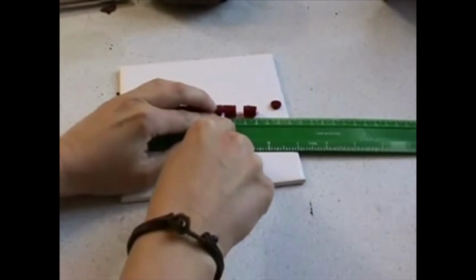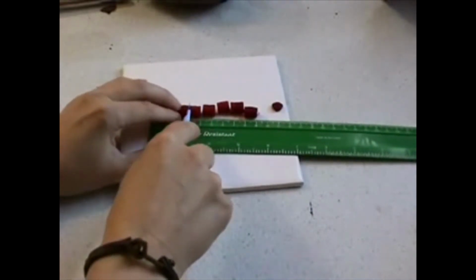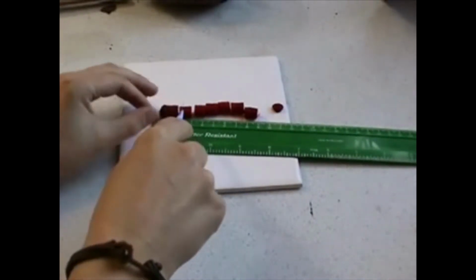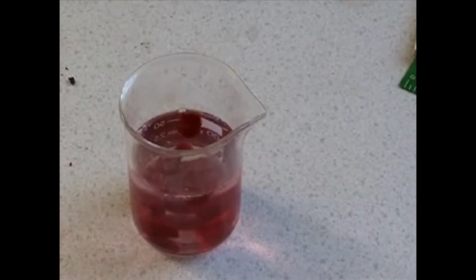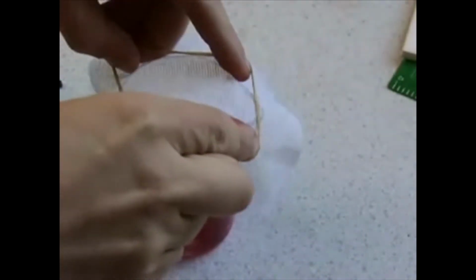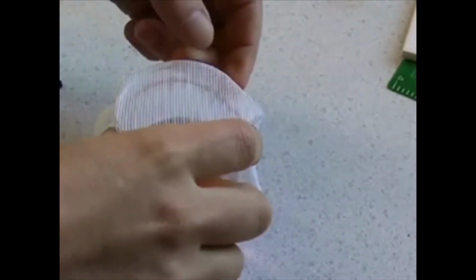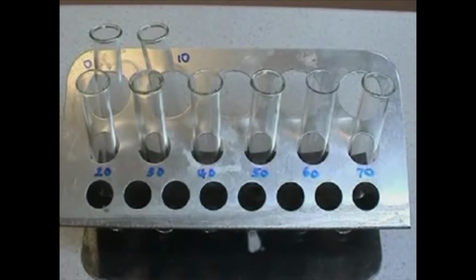These cylinders are now cut into discs, all of equal thickness, in this case 1 centimetre. The discs are now placed into a beaker of plain water where they will be rinsed overnight in order to remove any of the purple pigment that's leaked out due to the cutting procedure. The experiment depends on measuring the amount of pigment leaked out due to temperature effects, so any that's due to anything else needs to be removed before the experiment starts. They're rinsed under running water for at least 12 hours.